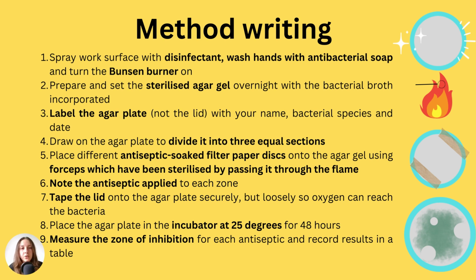The second thing you want to do, your technician or your teachers will often do this for you. So if you've done this in class, this has probably been prepared for you to save some time in the lesson. But essentially, you want to prepare and set your sterilized agar gel overnight with the bacteria broth incorporated. So the gel itself will have the bacteria already in there. And we call this a lawn.